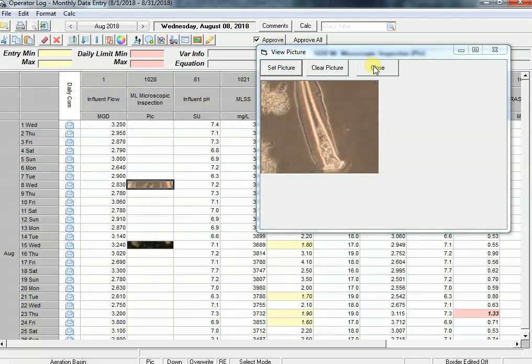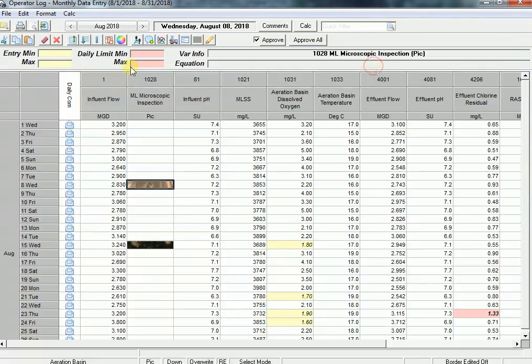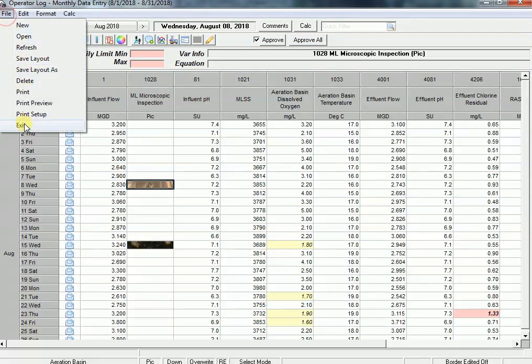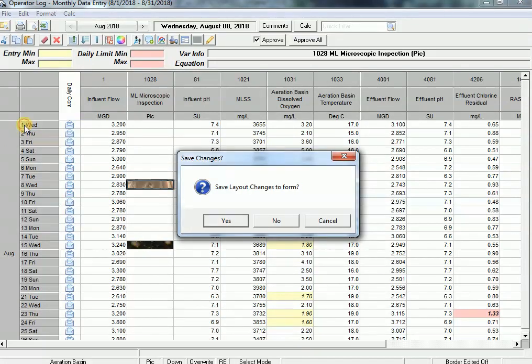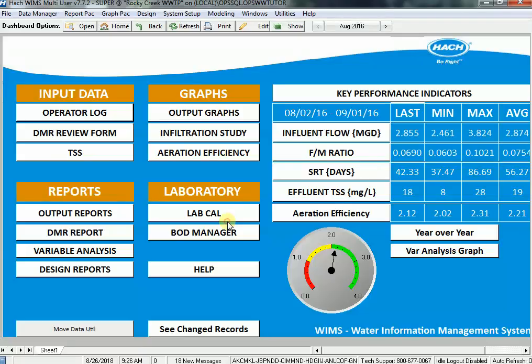I'm going to close this window and exit. It's going to ask me if I wanted to save the layout changes to the form because I added this parameter. I say sure, yes. Let's do that.